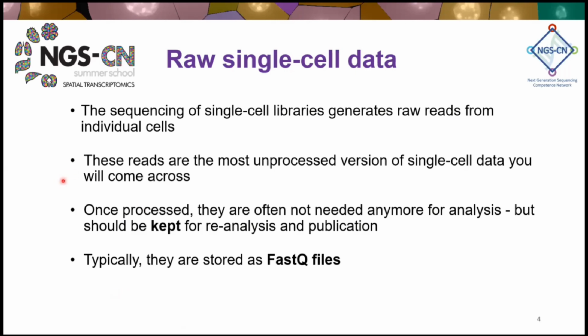For the FASTQ files, I should note that we need these raw FASTQ files for the step I will show you now, but later they are often not needed anymore. So you could think, okay, now I have counts already, I don't need the FASTQ files. They are big, they are messy, I can get rid of them. But this is not true, and I would advise against it, because it could be that you need to reanalyze certain data, and then you will need the FASTQ files.